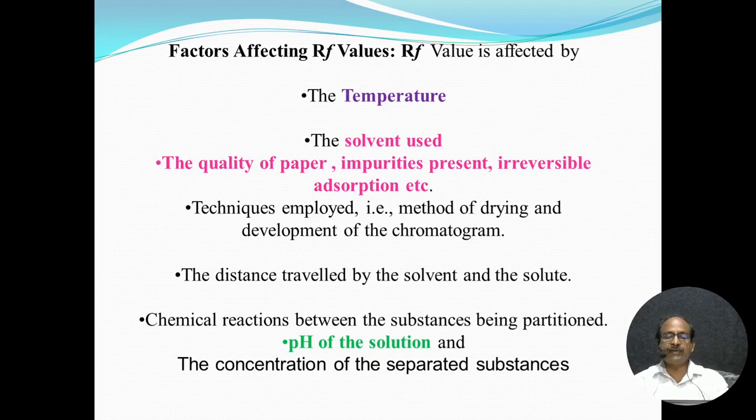After this comes the Rf value, which was already mentioned. Is there any effect on the Rf value? Definitely. First, it is affected by temperature. If the temperature is higher, for example in midsummer when your laboratory temperature is very high, then the Rf value will definitely change. Another important factor is the solvent used. If the solvent is, say, 99%, 98%, or 78% pure, that has a most adverse effect on your Rf value.